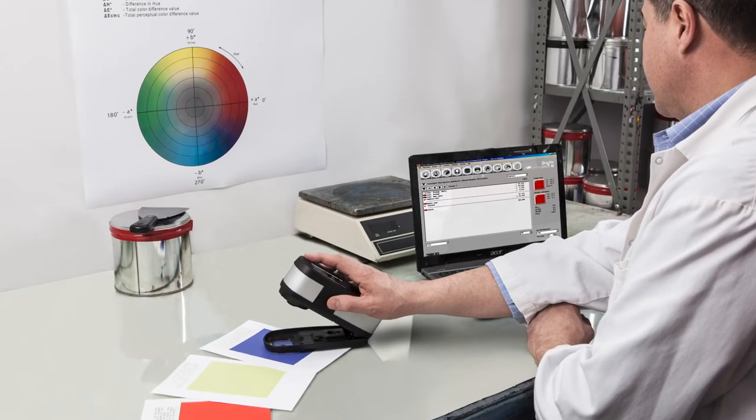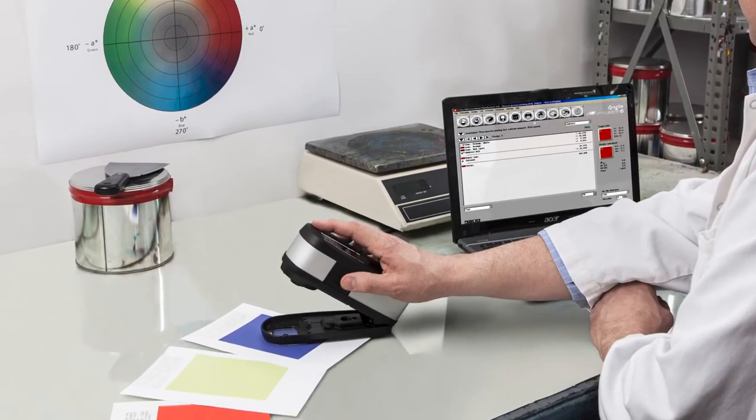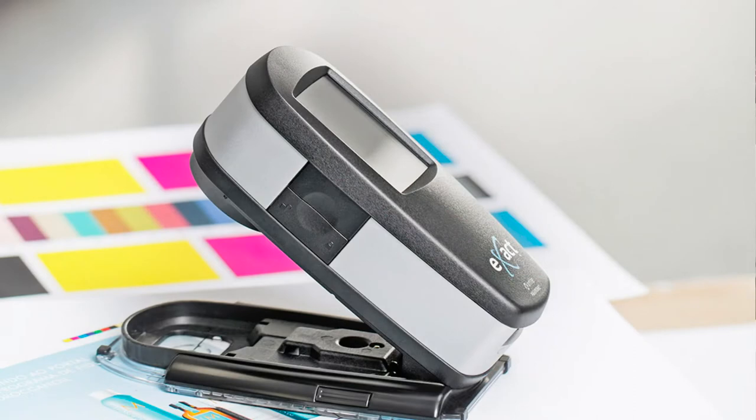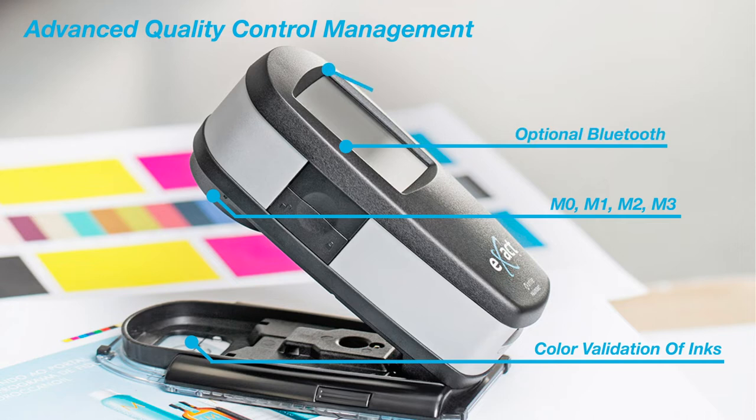The Exact Advanced Spectrophotometer is the preferred instrument of ink labs and quality control labs, designed to help you achieve the highest quality product with the broadest tool set. In addition to ensuring color validation of CMYK and spot color inks, simultaneous measurements of 4M modes, embedded Bluetooth capability, and enhanced color metric functionality, the Exact Advanced includes functions to evaluate ink and paper prior to, during, and after print production.